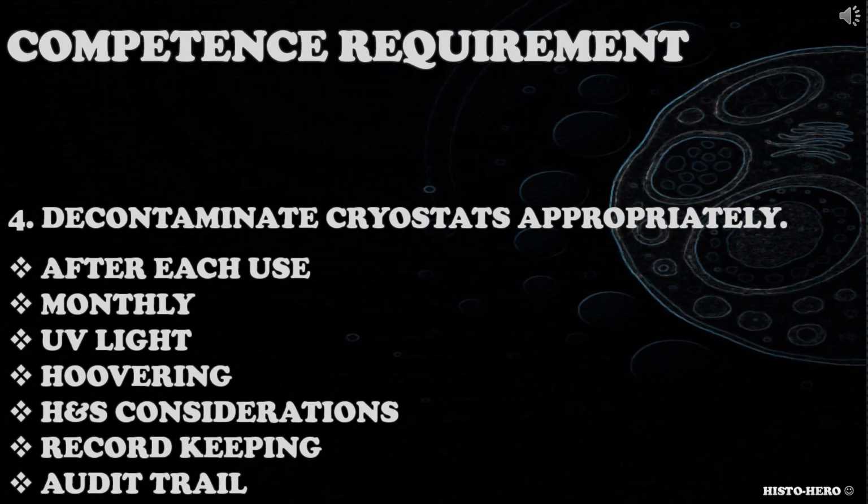The fourth competence requirement is decontaminate cryostat appropriately. Candidate should be able to decontaminate cryostat. Does the candidate decontaminate cryostat appropriately? Do they take the correct steps during cryostat decontamination? Do they know when to decontaminate cryostat and why? Do they record decontamination correctly?